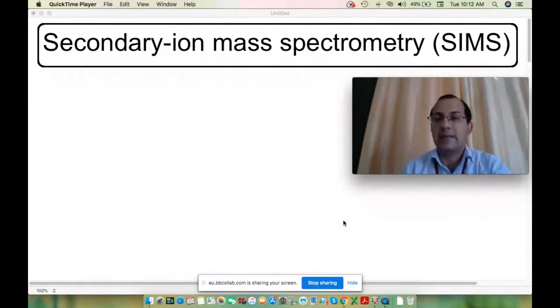The overall aim was to address how an FTIR spectrometer works, what its uses are, and how to change your FTIR spectrometer corresponding to the wavelengths, because you are not working on a single wavelength.